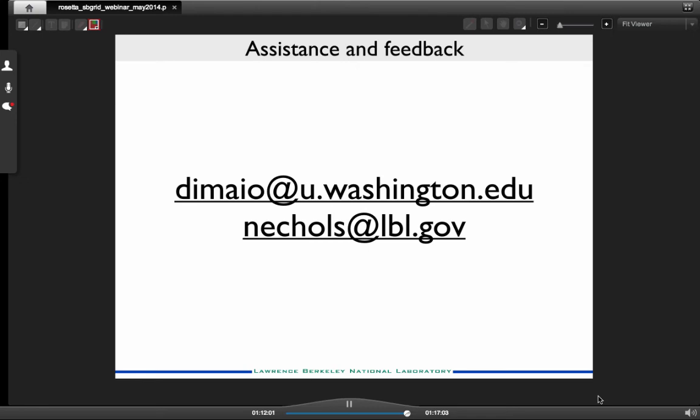Oh. And there's a chat question here asking about the DEN-CNS combination, and they want to know, isn't DEN also incorporated into Phenix? Yeah, there's still some issues with the performance. We haven't been able to get it working quite as well as the CNS implementation. So eventually we want to make that more fully supported, but it's been somewhat on a hiatus right now.